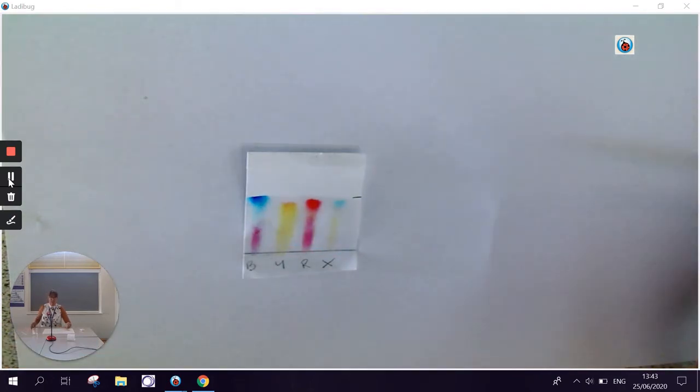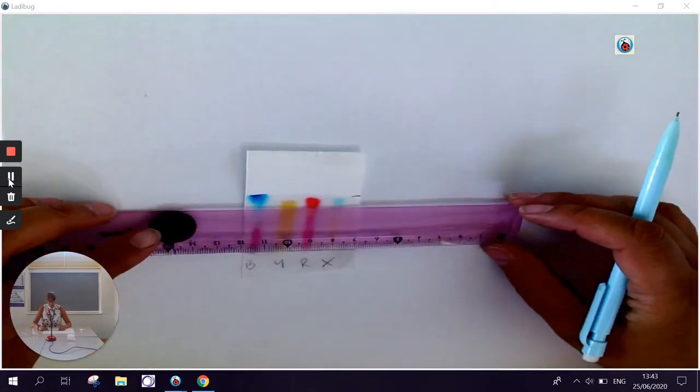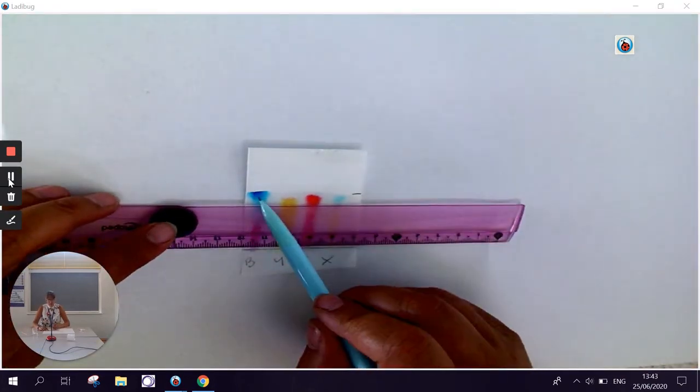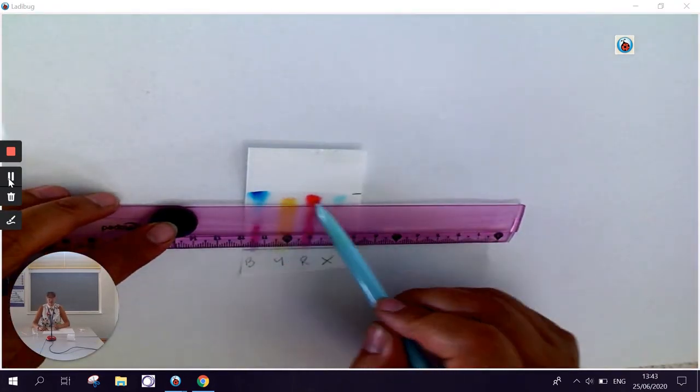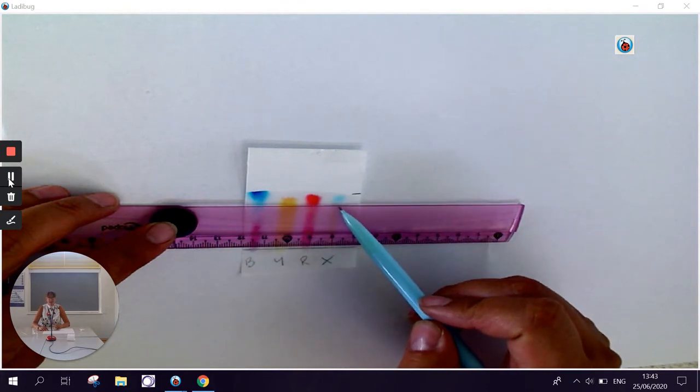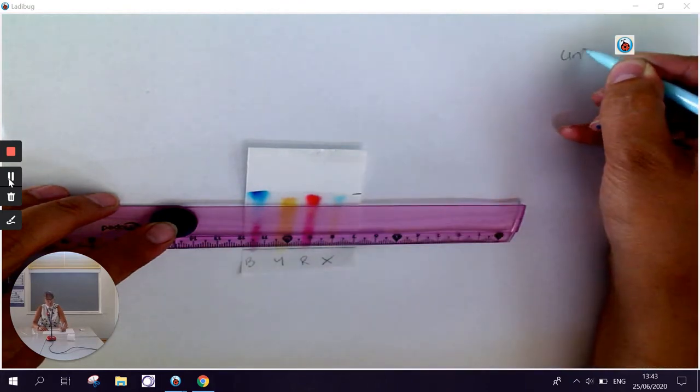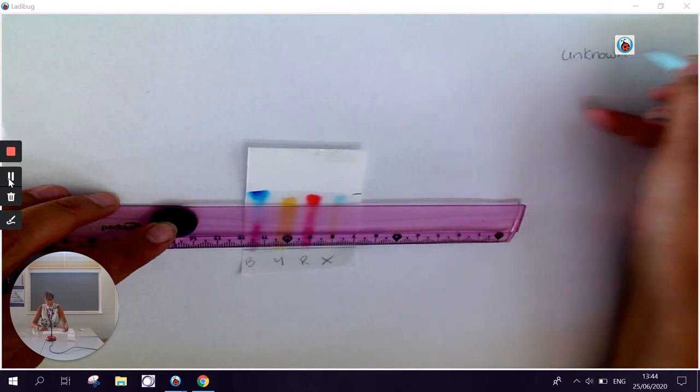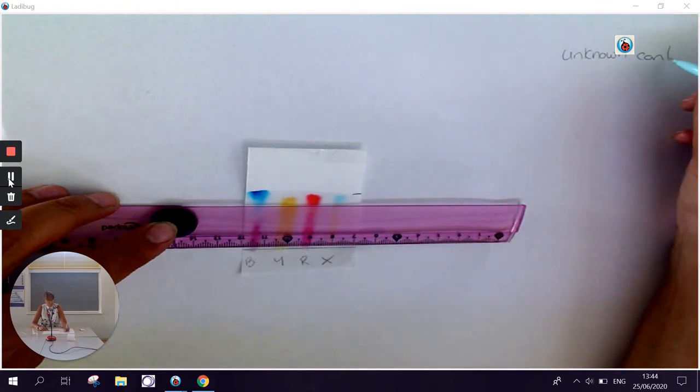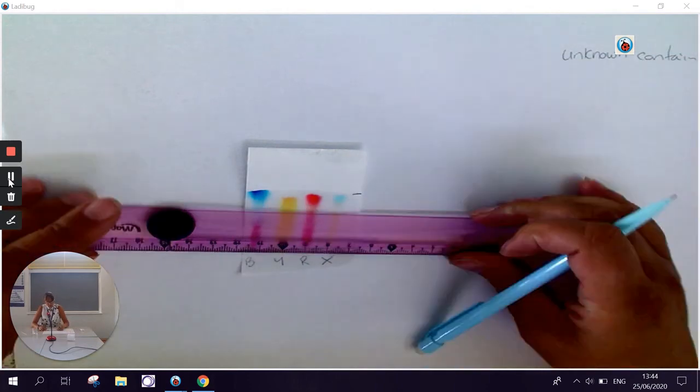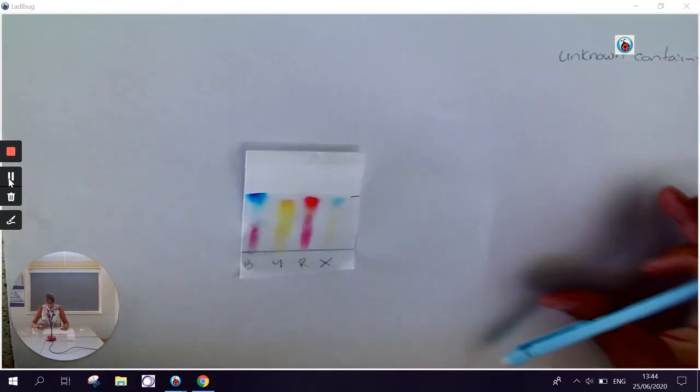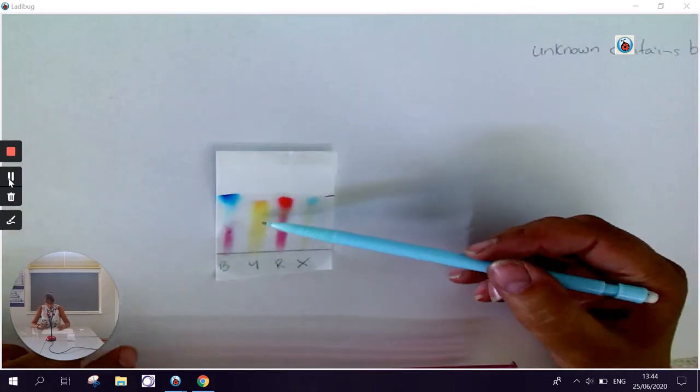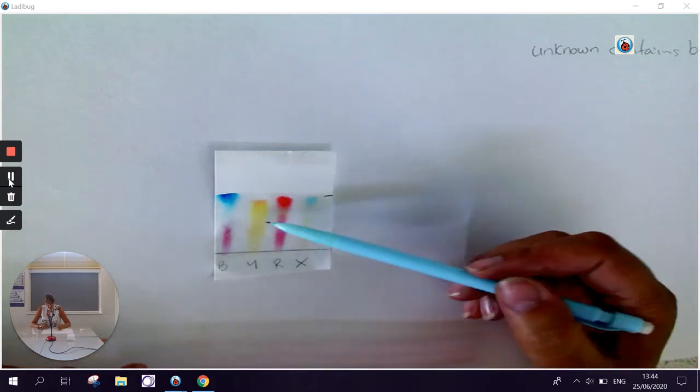If I look across and take my ruler, then the blue spot here lines up with the blue spot here. So we can see that the unknown has got blue in it. And if I look a bit further down, I can also see that there is some yellow in it as well.